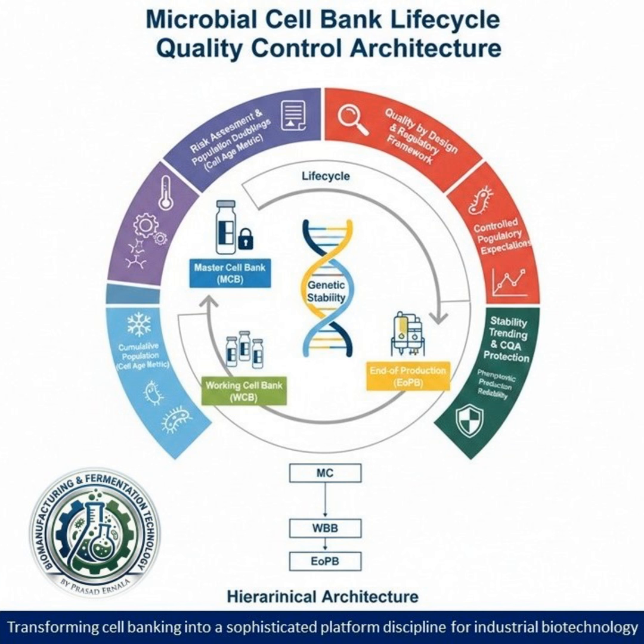Today, we are taking a long, cold look at what is arguably the single most critical component in modern biomanufacturing. And yet it's the one that's so often overlooked. Exactly. Microbial cell banking. When you hear that term, I think most people just picture a freezer farm, a logistical task. Right, just archival storage. But that's the big misconception we need to dismantle today.